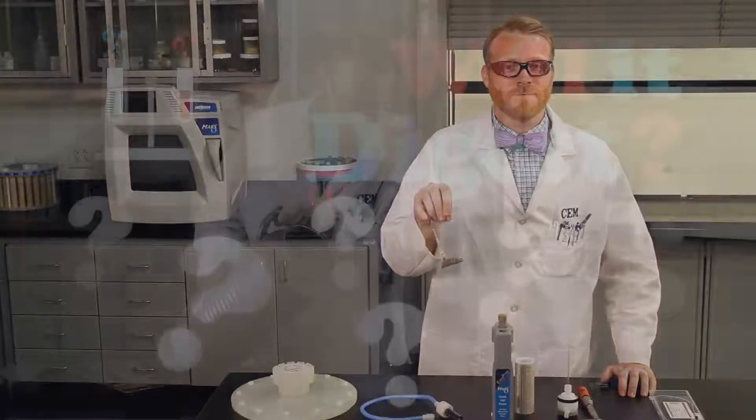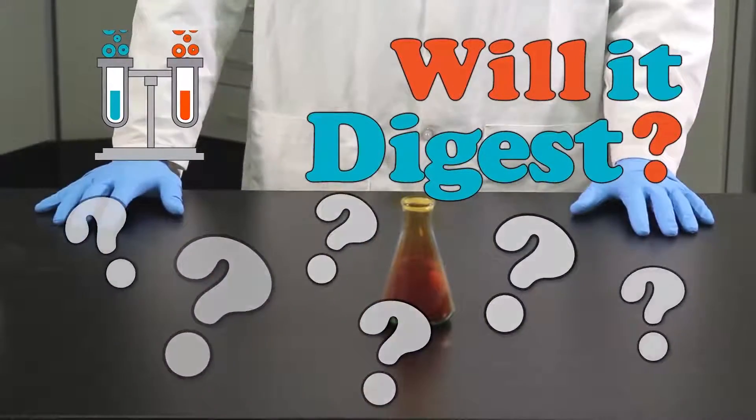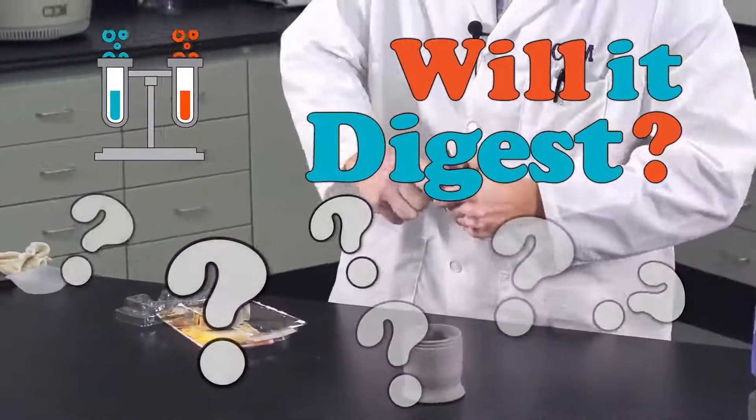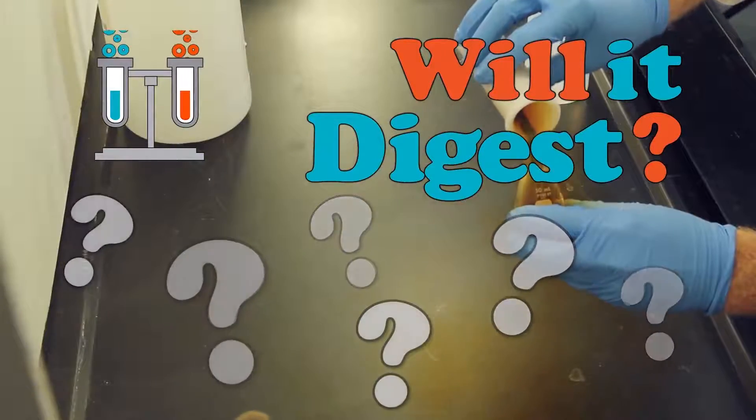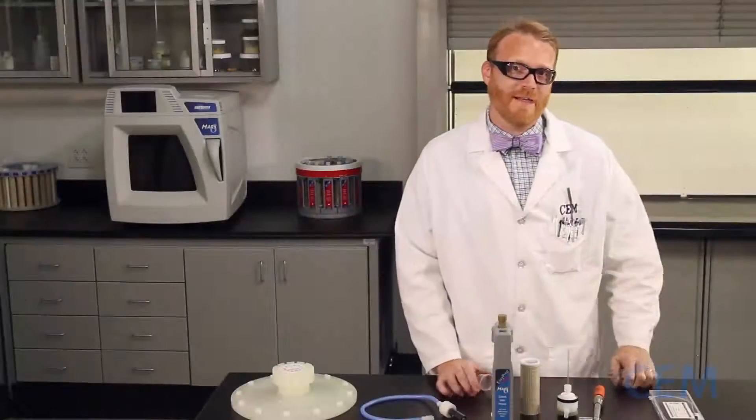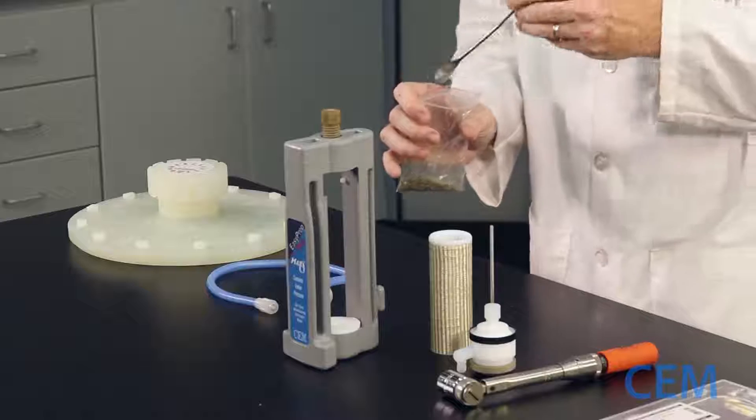Will it digest? Let's find out. First we need to get a representative sample. About a quarter gram will do. We'll save the rest for further testing.